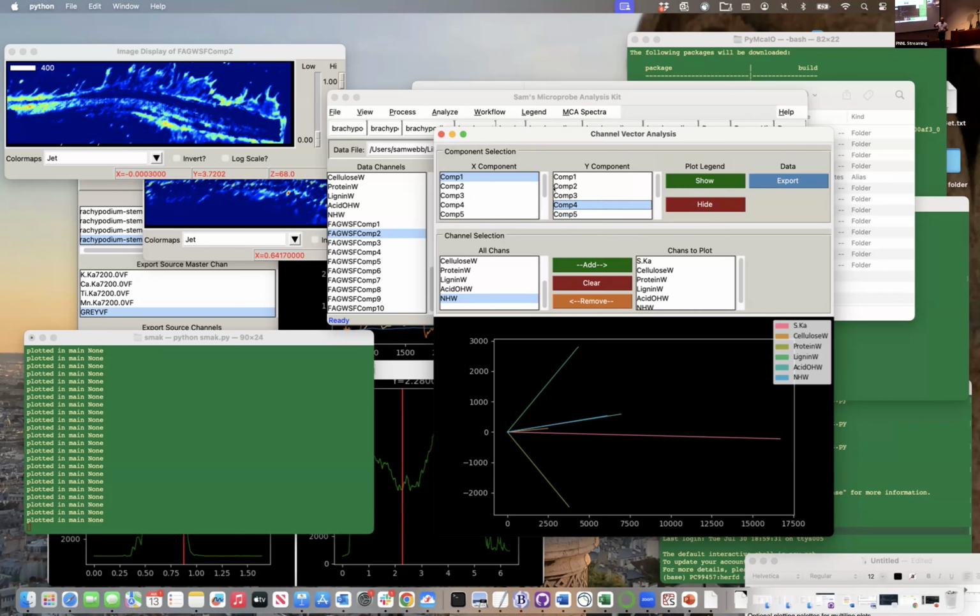And with the MALDI, it was even more difficult because we had this big micromodel that we could see, and then when the MALDI was done, they drew a little marker on it, and so I got the JPEG of the marker spot to the MALDI data. That actually worked out really well because the marker mass spec was different than the rest of the mass specs. I could actually see the outline of the marker and match that on the optical image really nicely.